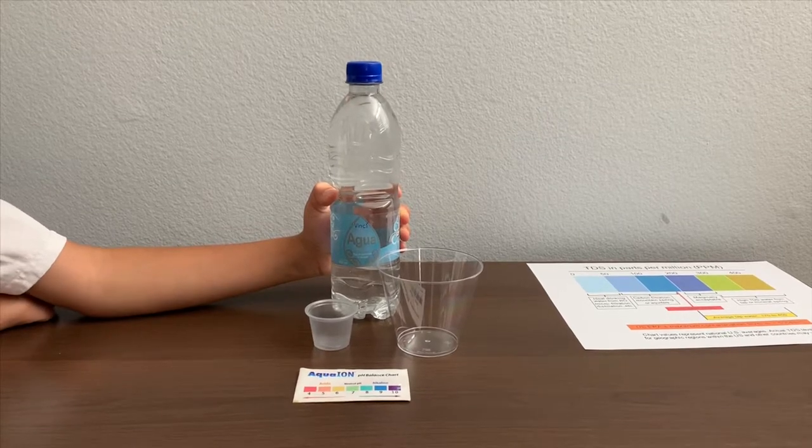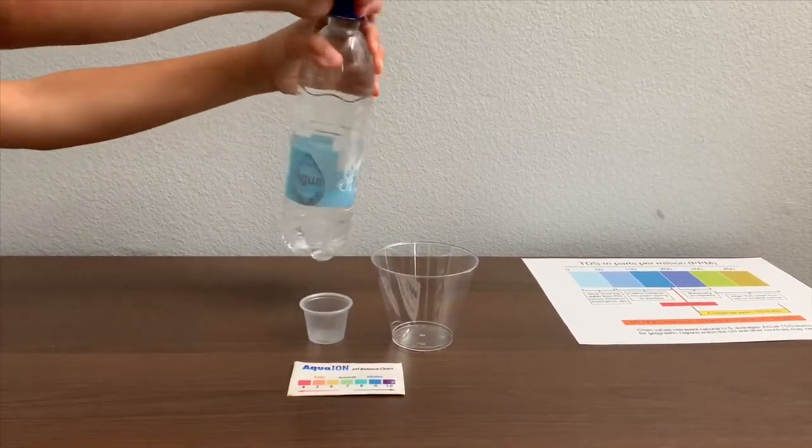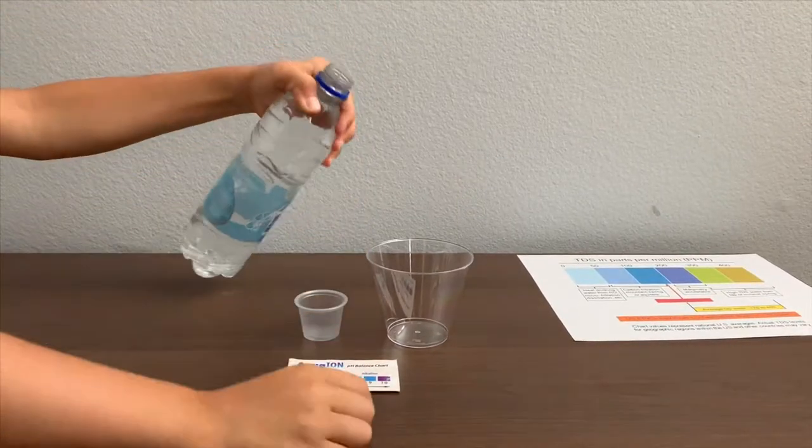Let's test the pH and TDS. Let's pour some water in.